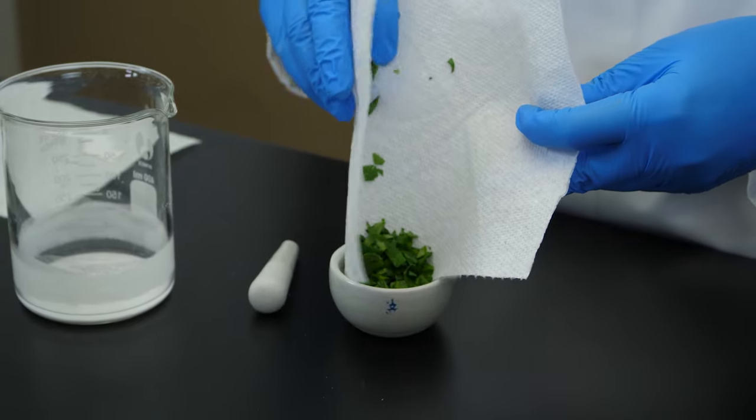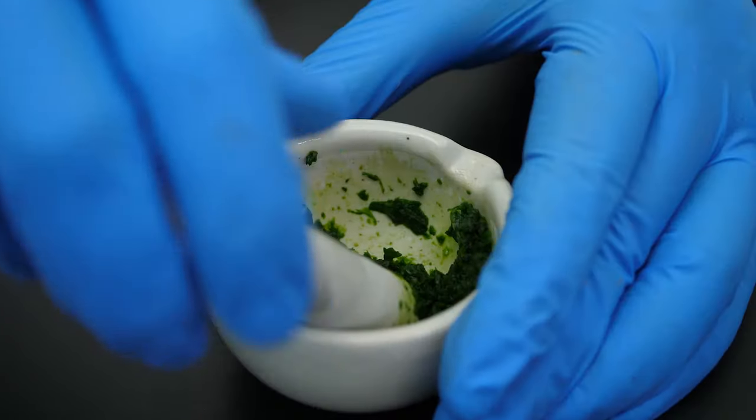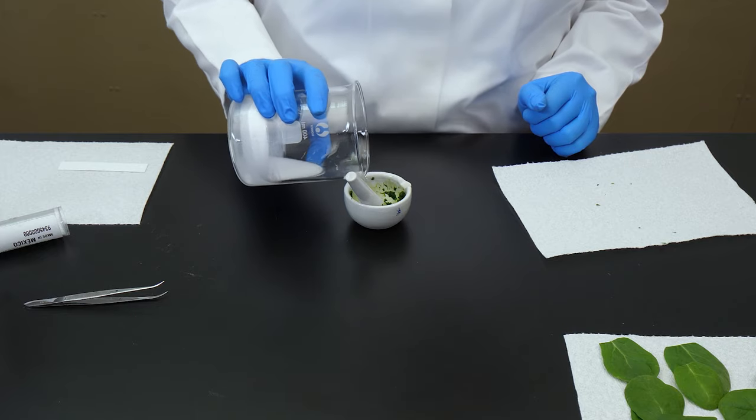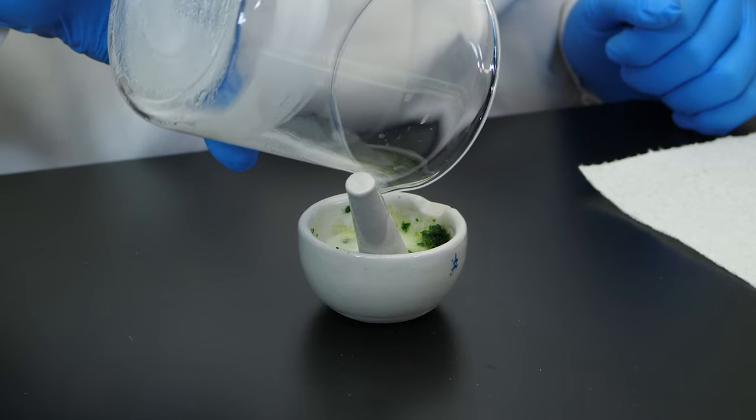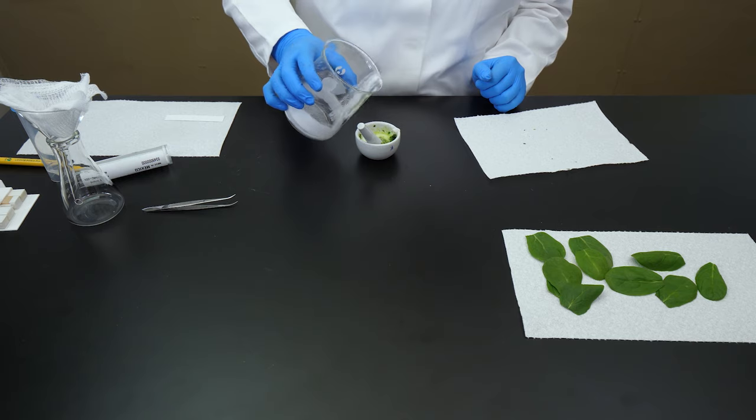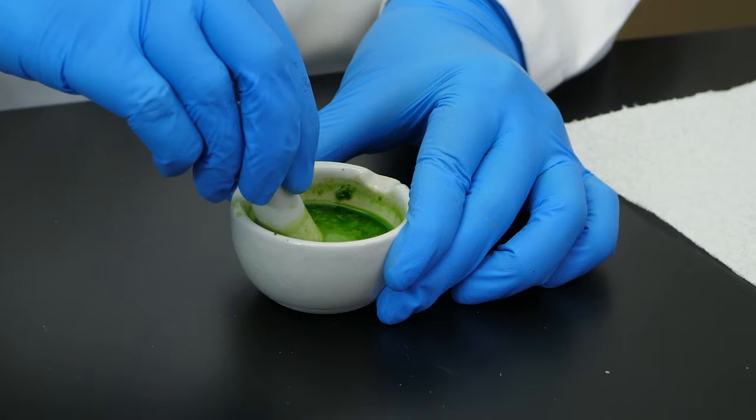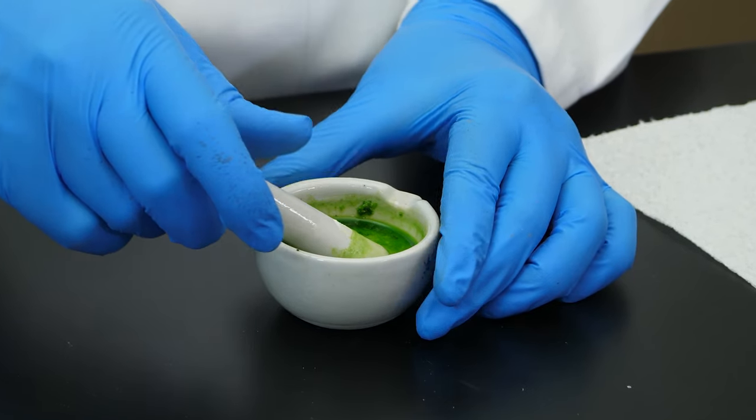Using a mortar and pestle, we smash up some spinach leaves and mix them with a solution of calcium carbonate and acetone to draw the mixture of pigments out of the leaf. Let the contents stand for five minutes.